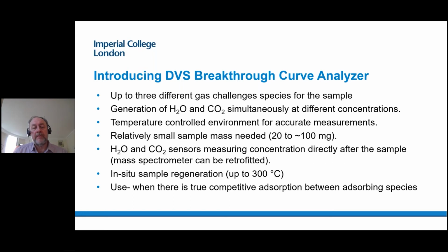So the technique I'm going to talk about now is not a new technique. We certainly didn't invent it, I didn't invent it, it's been around for many years, but we're refining it. We're looking to do what's called breakthrough analysis, and in a moment I'll explain a bit about it. What it allows us to do is generate a stream of CO2 and H2O simultaneously. They can be different concentrations. We will have a temperature-controlled environment. We will then take that gas stream and pass it over the sample, and we're going to look at the concentration that enters the column and the concentration that exits the column, which is of course packed with our adsorbent.